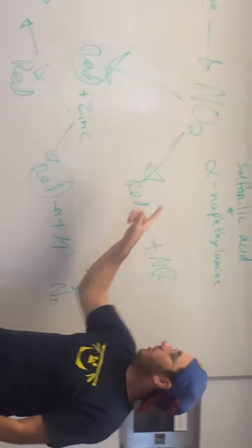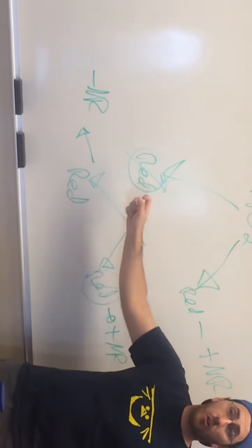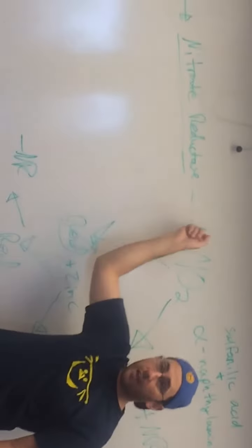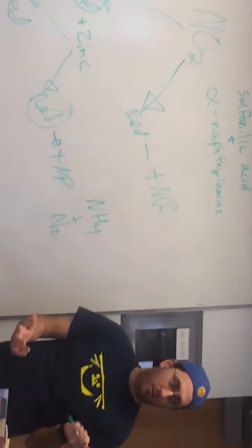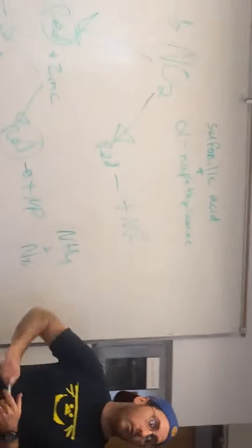You need to tell me what's happening, what we're looking for, what reagents we're adding, why we have the reagents, what color changes the reagents produce, how we interpret those, and what those mean. A red color change means we're positive for nitrate reductase because reagents A and B reacted with nitrite. It's not just red means positive for nitrate reductase. You need to tell me why. I want the complete story. This is like a 15-point question.